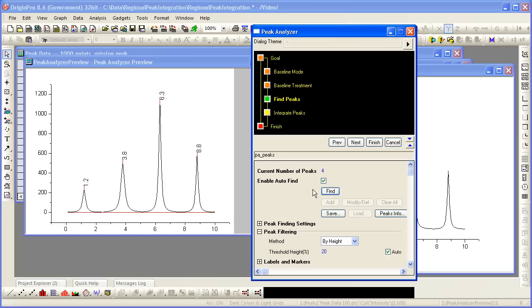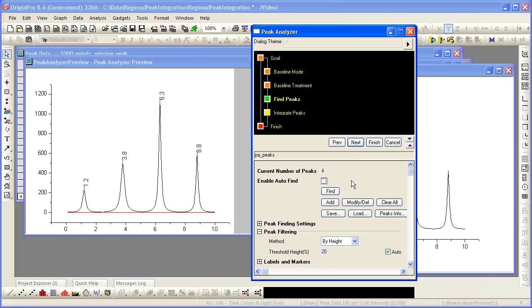However, the key to making this method work is unchecking the enable autofind option before moving on. If you leave autofind checked, subsequent datasets will be auto-adjusted by origin and peaks may or may not be found depending on their height. So it is important that this box be unchecked before moving on.